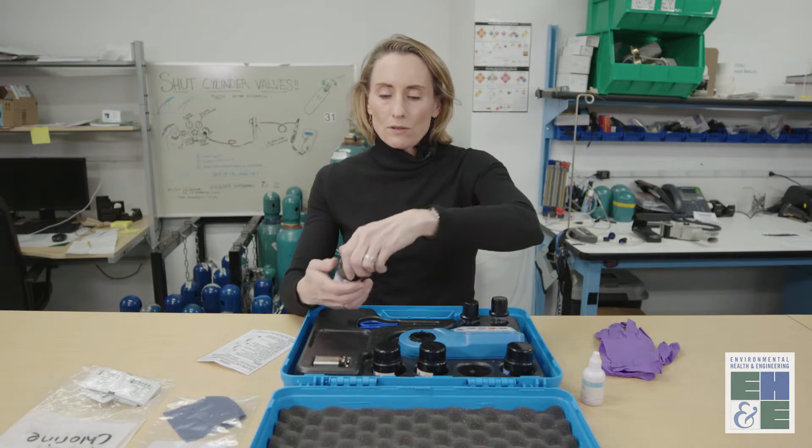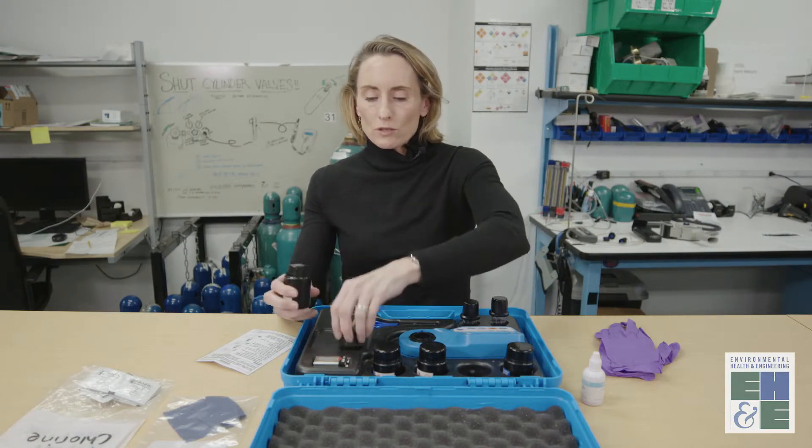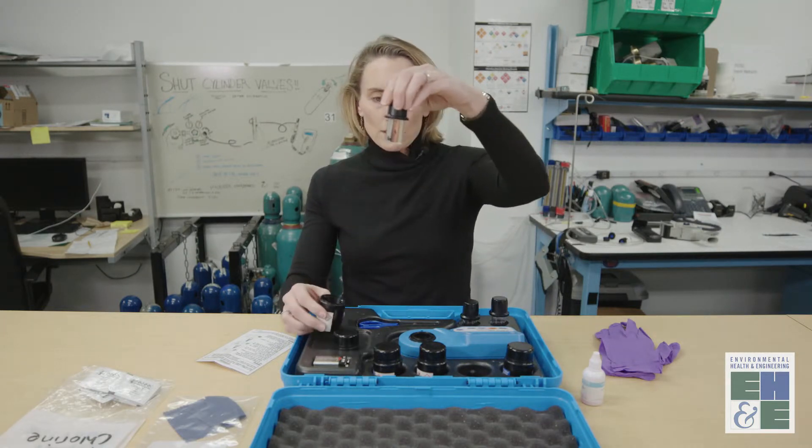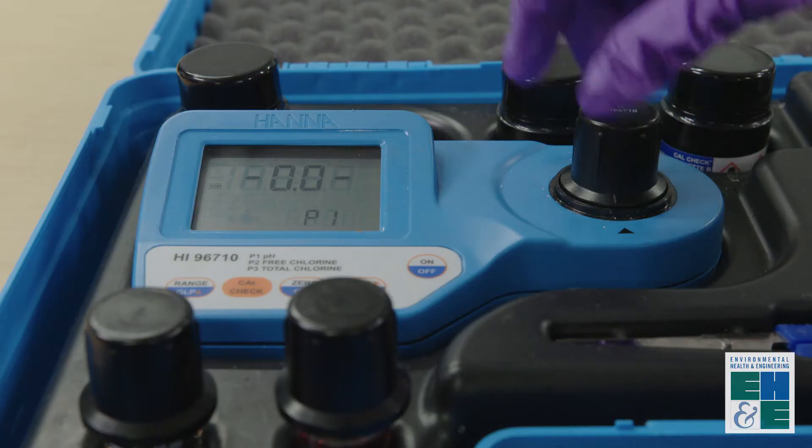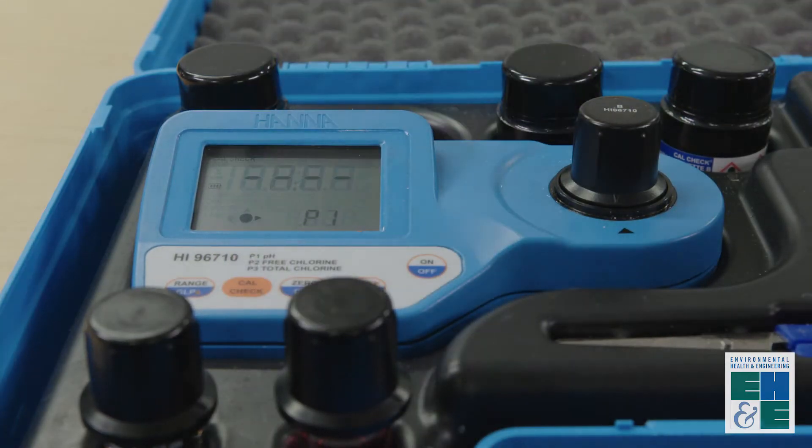And then you'll insert the pH spiked standard. Line the arrows up until it clicks and then press CalCheck.